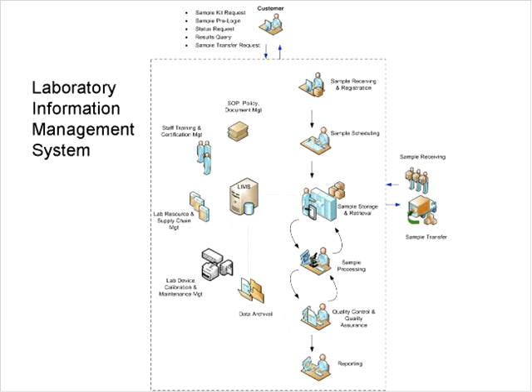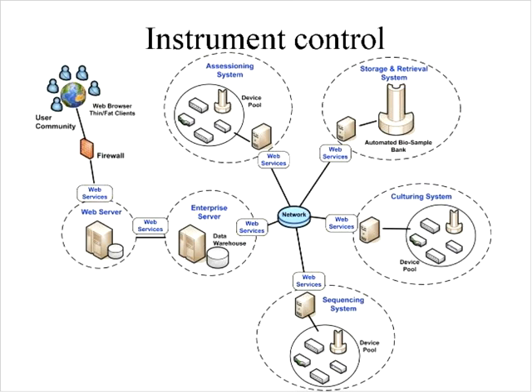So here I have just a little more detail on the laboratory information management system. Again, those of you who are familiar with LIMS systems, this is not going to come as any surprise. I would say the major challenge here has been the integration of the automated systems. And this is just to give conceptually, for those of you who are interested in the IT side of things, how we've managed to do that. As I mentioned, the core concept of the laboratory is this idea of having well-defined specifications for web services that allow for the LIMS system to talk to and integrate with those individual automated systems, which then themselves are comprised of many different pieces of instrumentation.